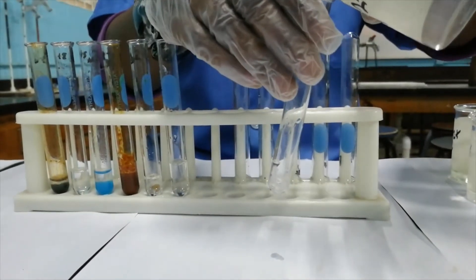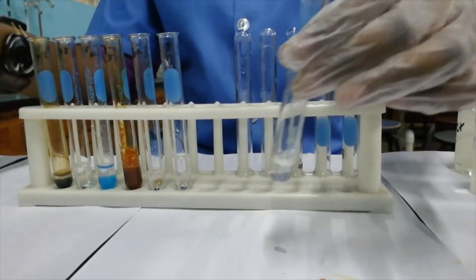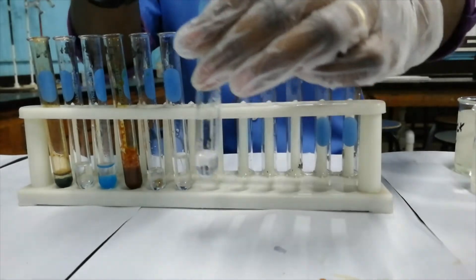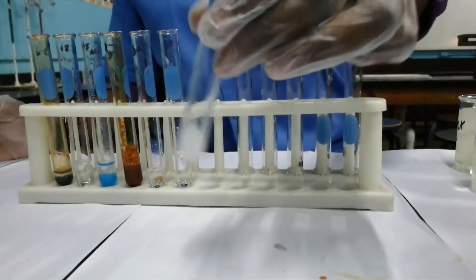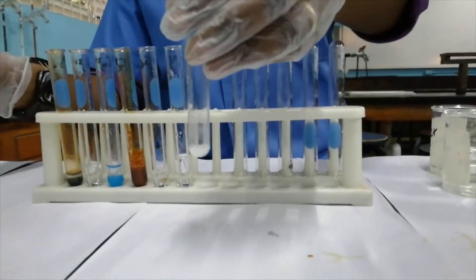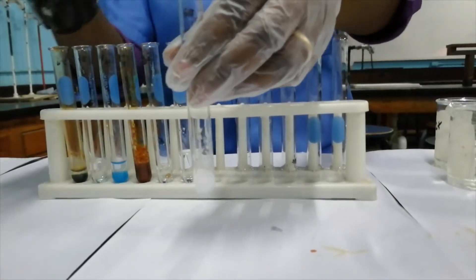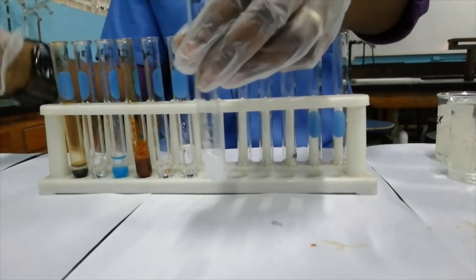The next cation being tested is the calcium ion, Ca²⁺. On addition of aqueous sodium hydroxide, we have the formation of a white precipitate. If most of the precipitate is poured off and we add excess sodium hydroxide, then the precipitate does not dissolve.